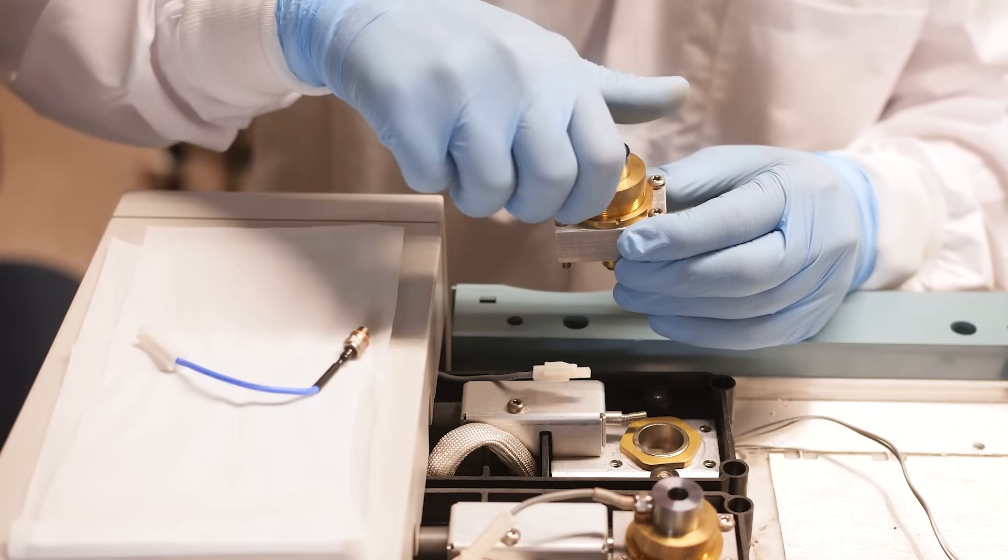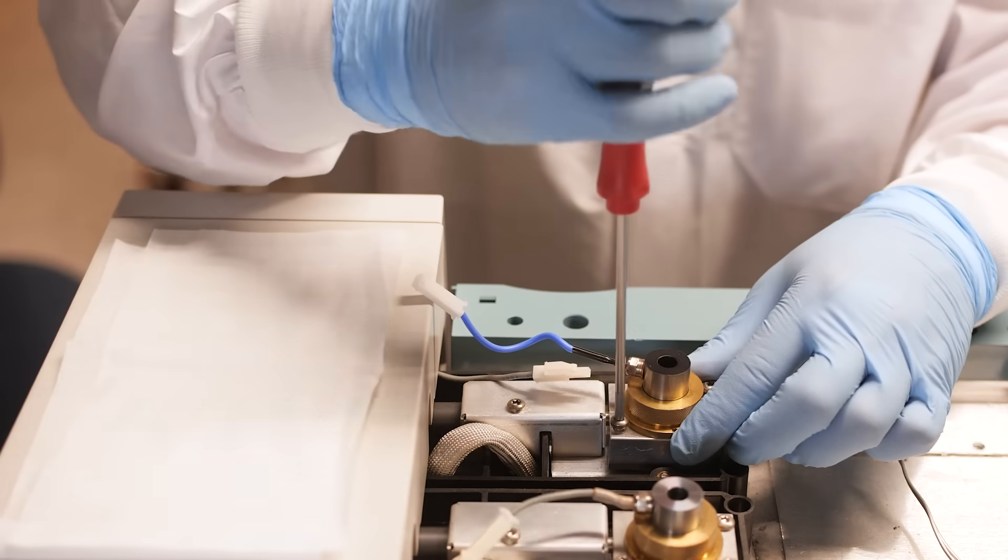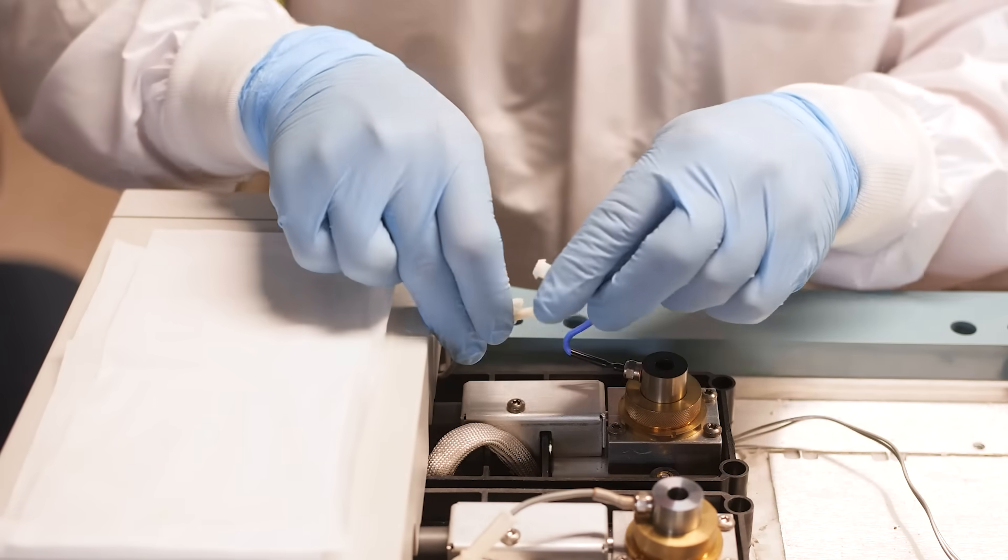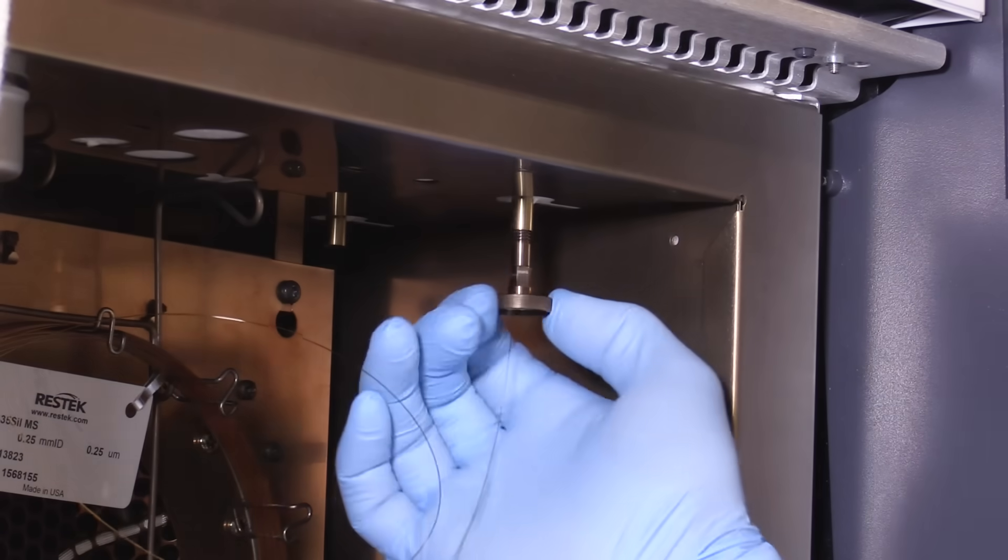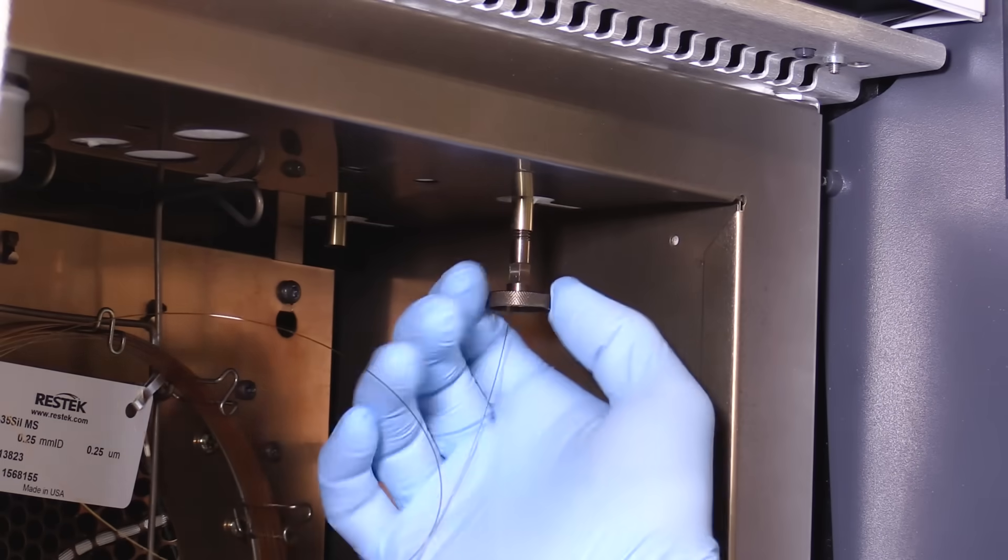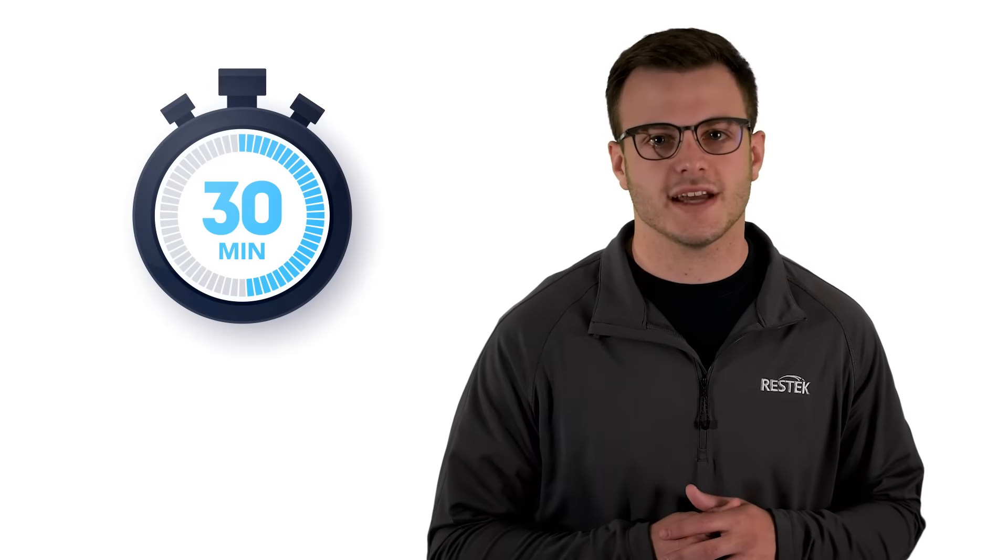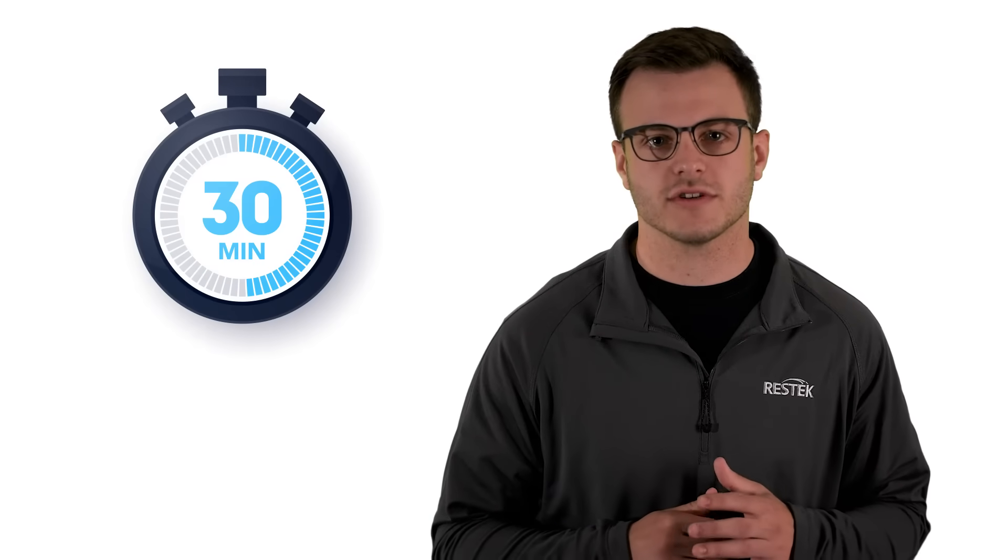Now that we have replaced these parts, reattach the FID body to the GC and reconnect the igniter to the castle assembly. Reinstall the column and return the GC and FID to its normal running conditions. Give the FID some time to condition at temperature to help drive off any volatile contaminants.